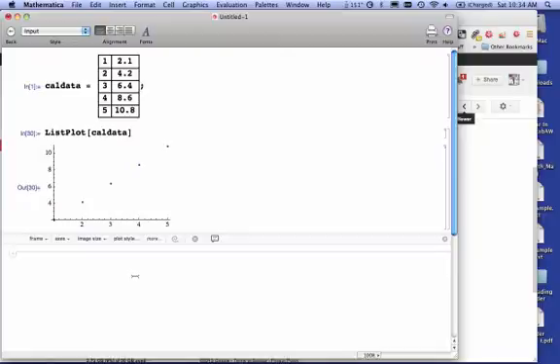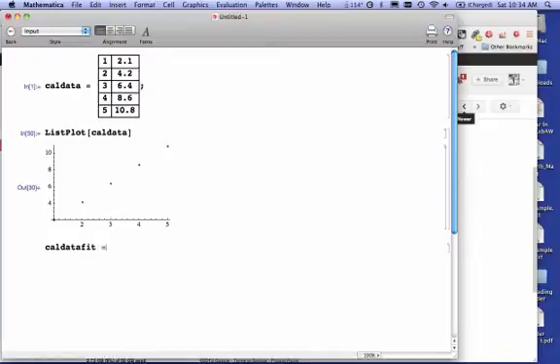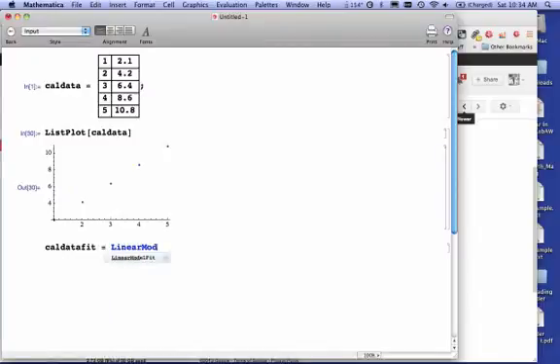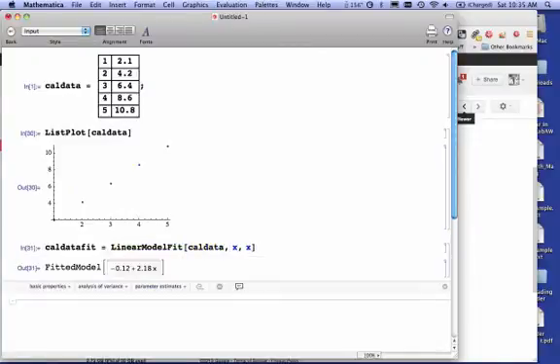My next step is to fit that data to an equation. So I'm going to call that CalDataFit, and I'm going to do a linear model fit of that data. The data is CalData, and I'm fitting it to X.